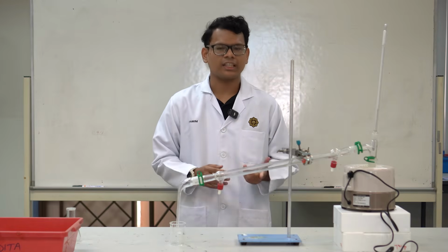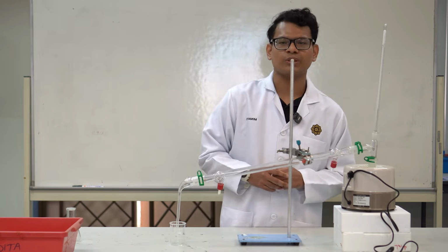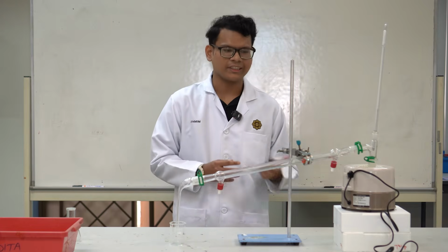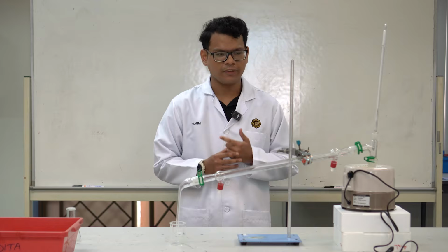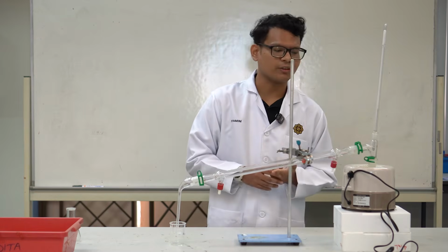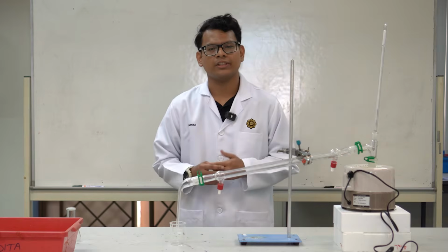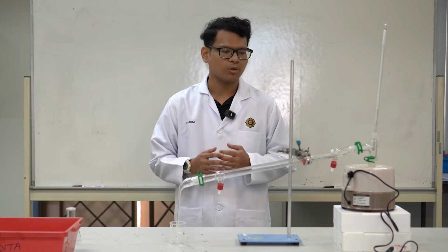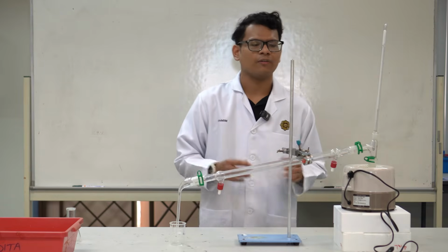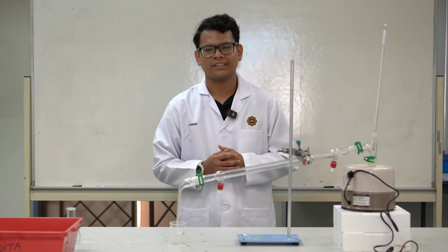There are three types of distillation that we should know. The first one is simple distillation, then fractional distillation, and vacuum distillation. Fractional and vacuum distillation are widely used on an industrial scale. So we are just going to be using simple distillation for our lab experiment practice.